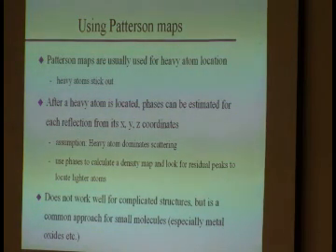So what we can do is we can go back to our original expression where we have no phases, remember? That is what we lose during data collection. And we can plug in the xyz coordinates of our heavy atom that we found from a Patterson map, okay, by using those u, v, and w equal to the interatomic distances relationships. And then we can actually calculate phases based only on the heavy atom. Are those the correct phases? No. They are not absolutely correct, but they are a much better approximation than having no phases, okay? Because that heavy atom is the strongest contributor to the phases.